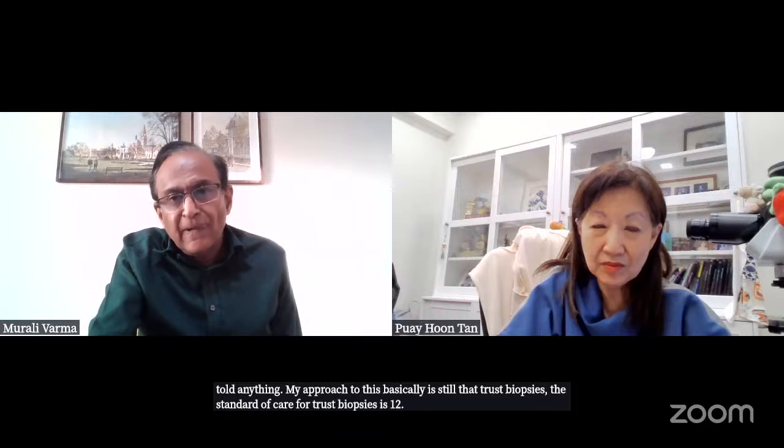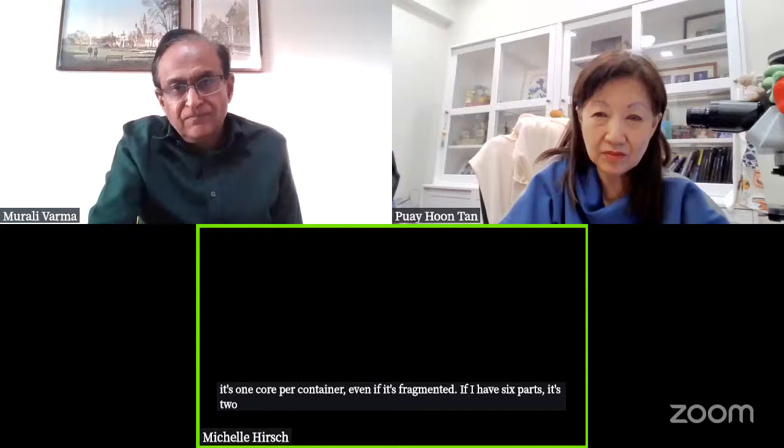So if I have 12 parts, it's 1 core per container, even if it's fragmented. If I have 6 parts, it's 2 cores per container, even if it's fragmented. If I can reconstruct based on those numbers, then I will mention 2 of 2 or 1 of 2. If it's completely fragmented into a lot of pieces, I just say X% of the total tissue.